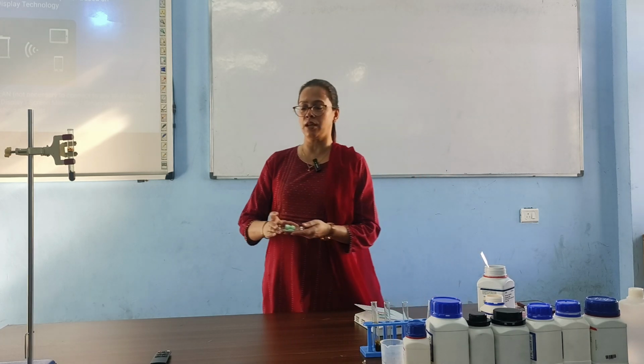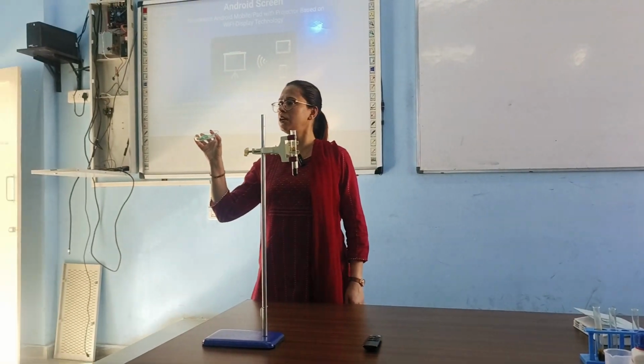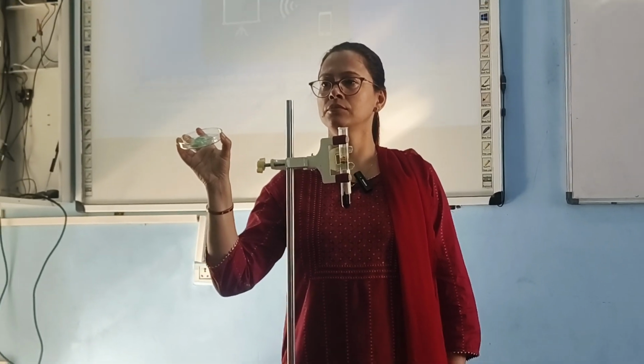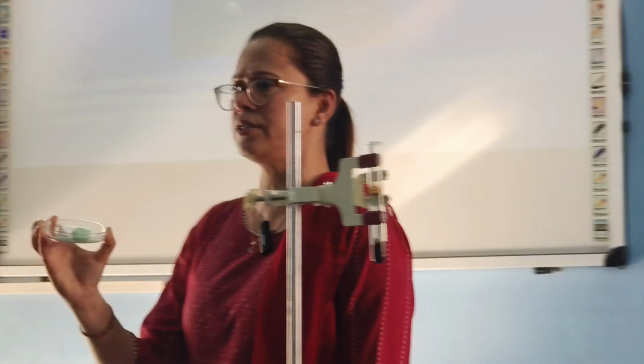This is ferrous sulfate. Is it visible? What is the color? Green. What is the structure? It is solid and crystalline. Does it look like sugar? See the structure. Is it like sugar? Yes, ma'am. It is a crystalline structure. What are we seeing today?